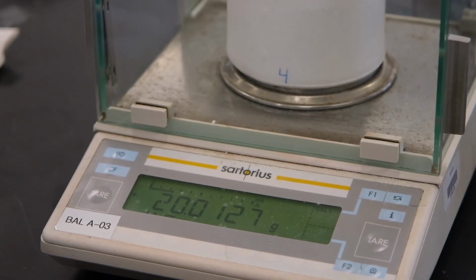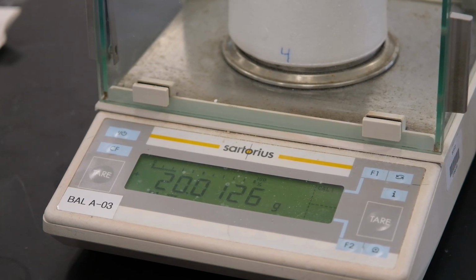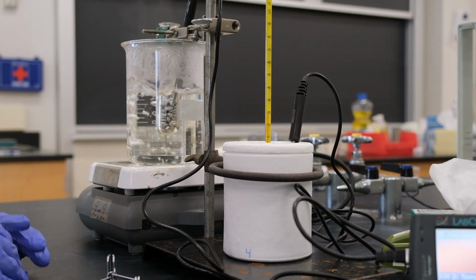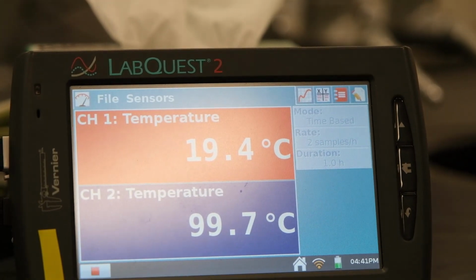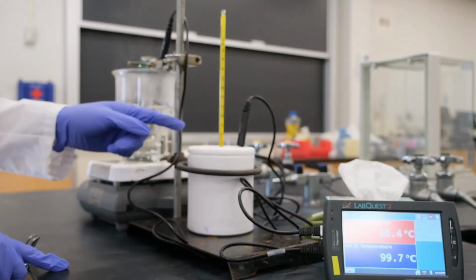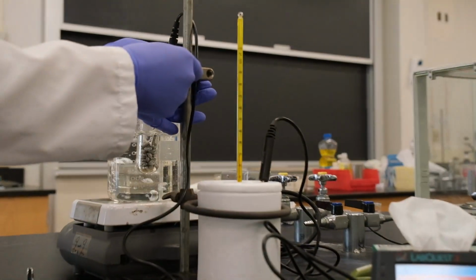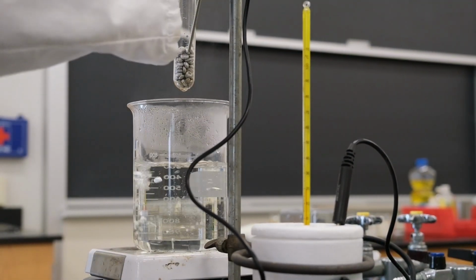Now record the mass of the water inside the calorimeter to the appropriate number of significant figures. So this is trial 1 of experiment 9. So first we're going to record the initial temperature of the water in the calorimeter, which has roughly 20 milliliters, and also the initial temperature of the hot metal in the water. So, did you record this one? Okay. So first we're going to extract the hot metal. Place it in the calorimeter.